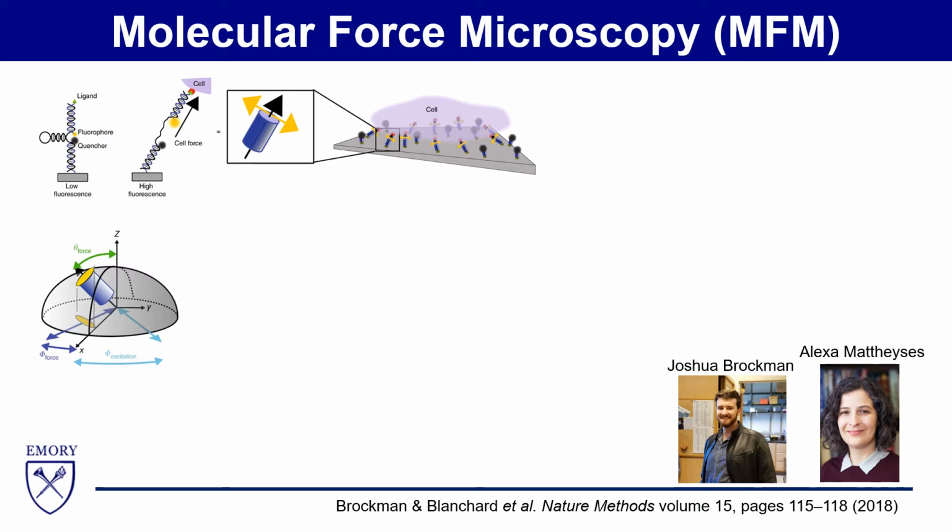Because the electric field dipole is restricted to the xy plane, you can get a sense of this by projecting the disk down onto the xy plane. The projection takes the shape of an ellipse. When the electric field is aligned with the long axis of the ellipse, the excitation is strongest, and so you'll achieve maximum fluorescence intensity. When the electric field is oriented with the short axis of the ellipse, you get minimal fluorescence intensity.